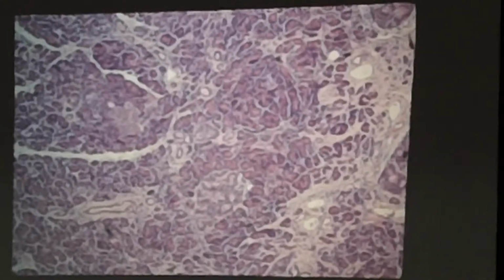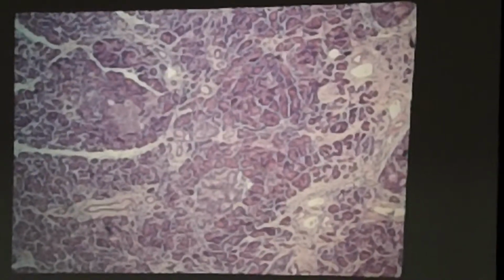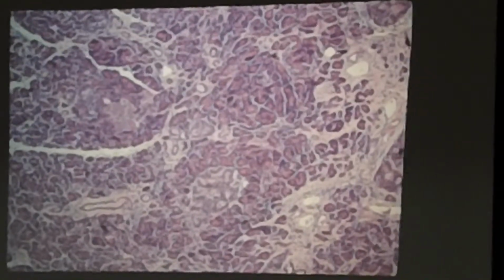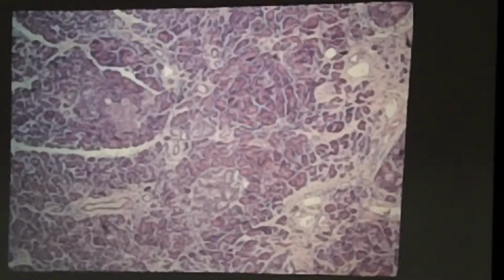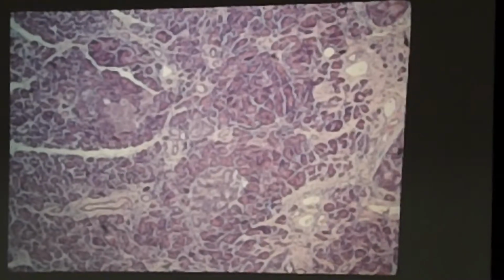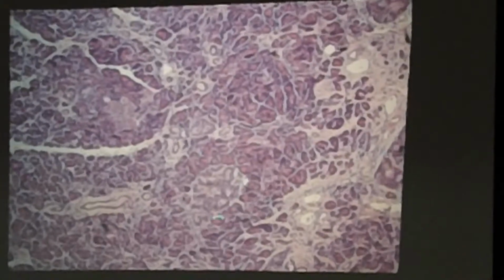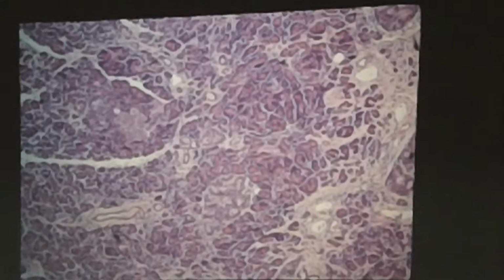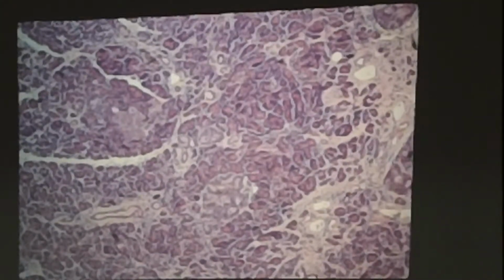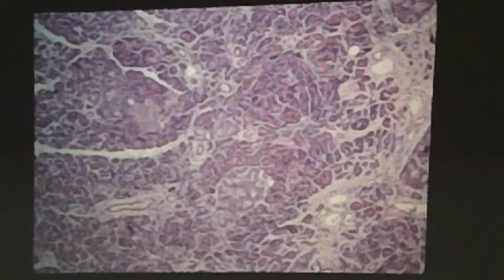Are there ducts? Got ducts. Are there serous acini? Lots of them. So just based on that, this could be the parotid, right? Except for these puppies. Islands floating in a purple sea. Islets of Langerhans. That makes it pancreas. So again, you see how just ducts and a few superficial characteristics on top of that help you start to sort these guys out.